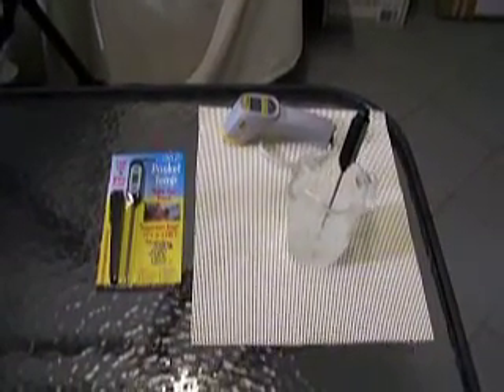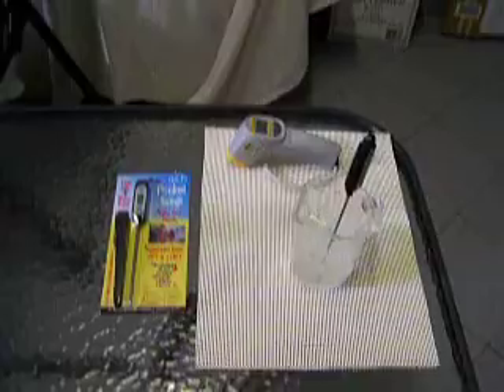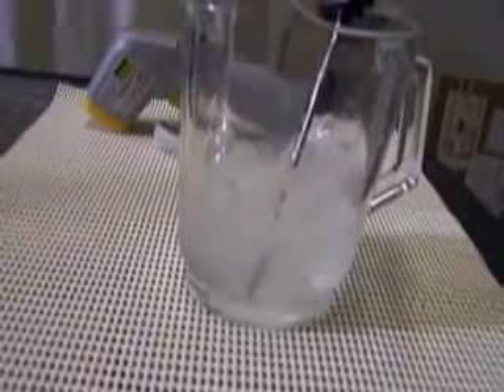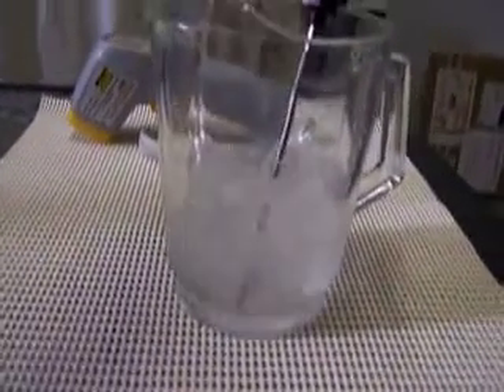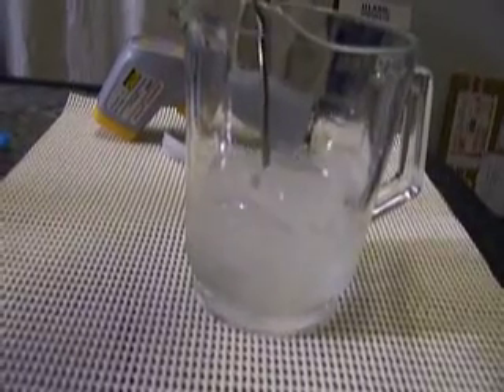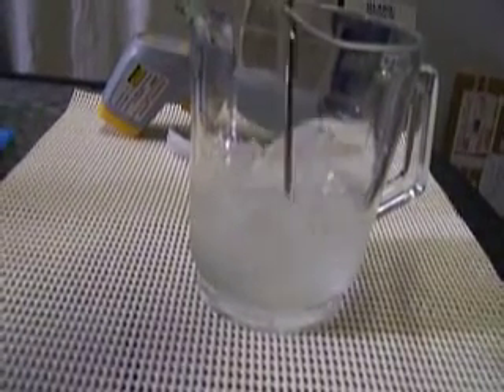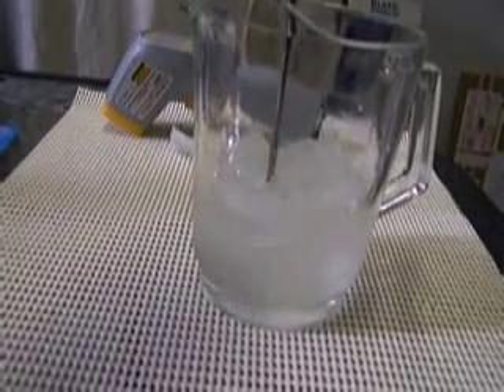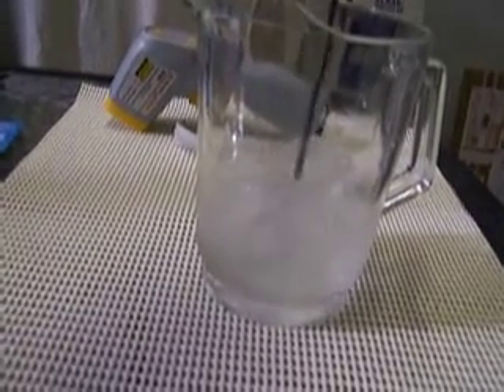An ice slurry is made up of 70% ice and 30% water. You can see this is an ice slurry we've prepared earlier, in a jug so that you can see it. It's just ice with some water. If we move the thermometer around you can see that it's mostly ice — not just a few cubes floating in a sea of water. It's 70% ice, 30% water. That is a true ice slurry.